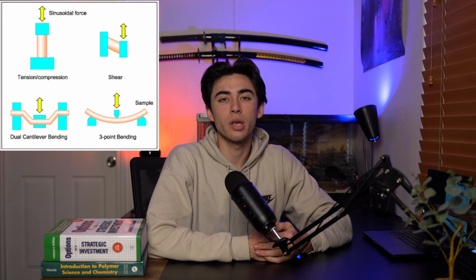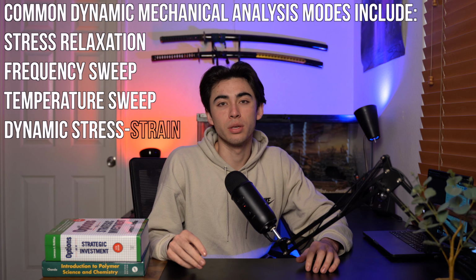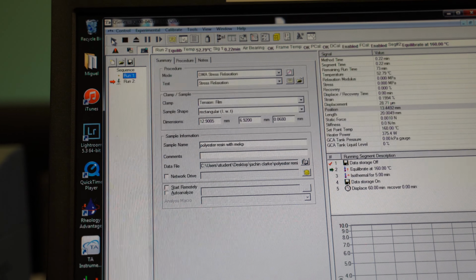Generally, a DMA will ask for a mode, test setting, clamp type, and dimensions of the sample. Common clamp types include tension, compression, dual cantilever bending, and three-point bending. The most suitable type should be selected based on sample shape, modulus, and measurement purpose. The most common modes include stress relaxation, frequency sweep, temperature sweep, and dynamic stress strain. Depending on what mode is chosen, extra parameters will need to be entered. For the determination of glass transition temperature, we will focus on using a temperature sweep with a tension clamp. After naming the run and saving the file, you can now press play to start running the sample.